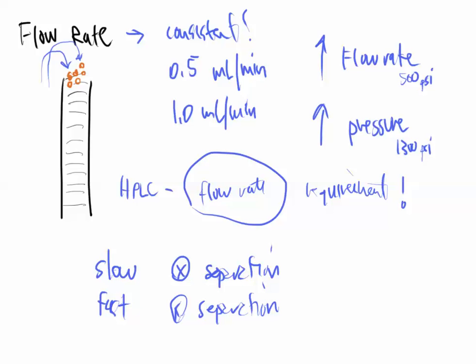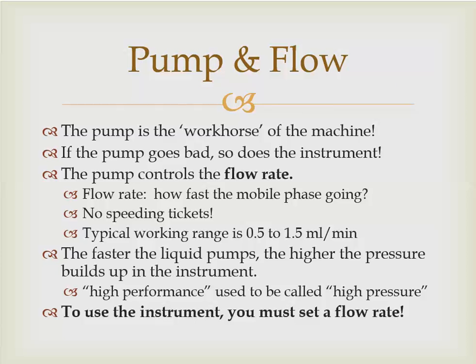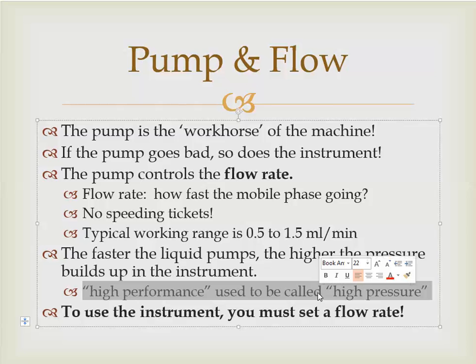So on the screen, again, flow rate very important, because flow rate is going to determine my pressure, and my pressure determines the separation, and flow rate is in the middle of all of that mess. So again, very, very important number for me to keep an eye out with.